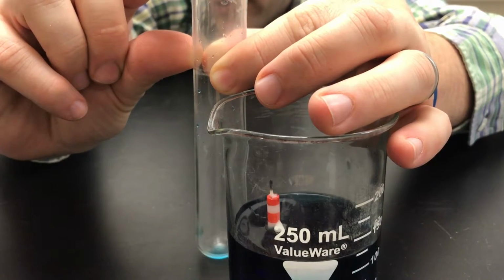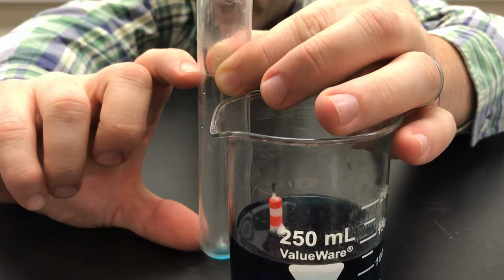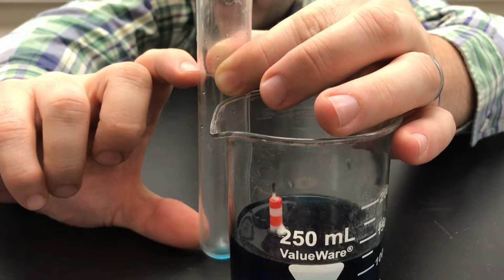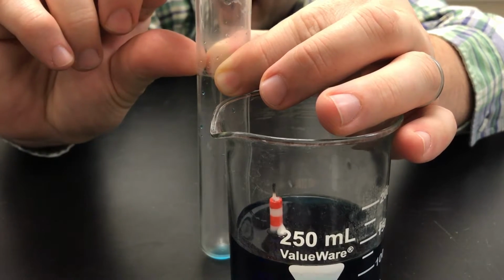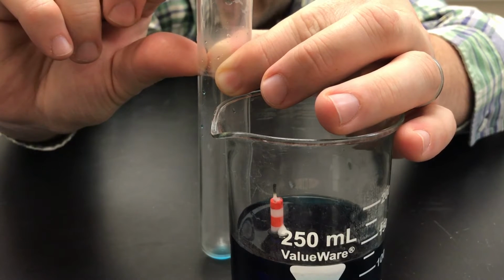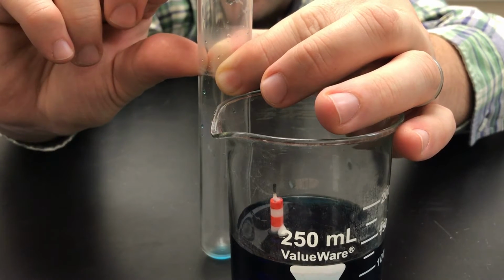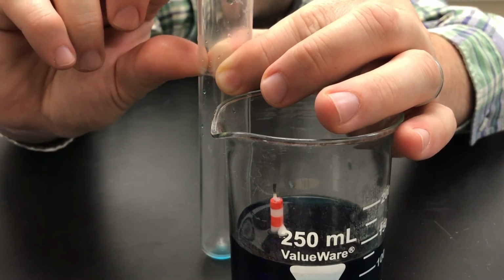I know the original volume of the test tube. I can find this volume by pouring in water and then dumping it out into a graduated cylinder, so I know the volume of the air that was not oxygen. I can subtract that from the original volume to get this volume here, which is the volume of the oxygen. And then I can turn that into a percent. I'll have the percentage of air, the percentage of oxygen that was in that air.